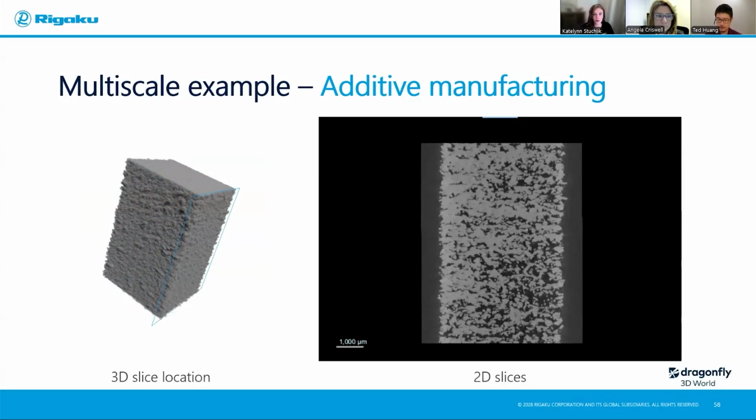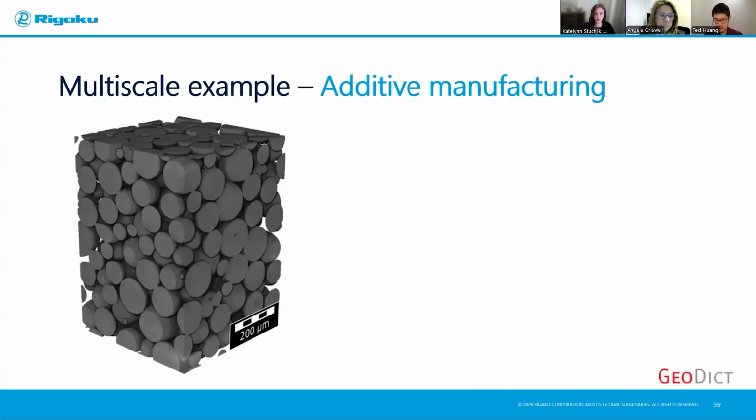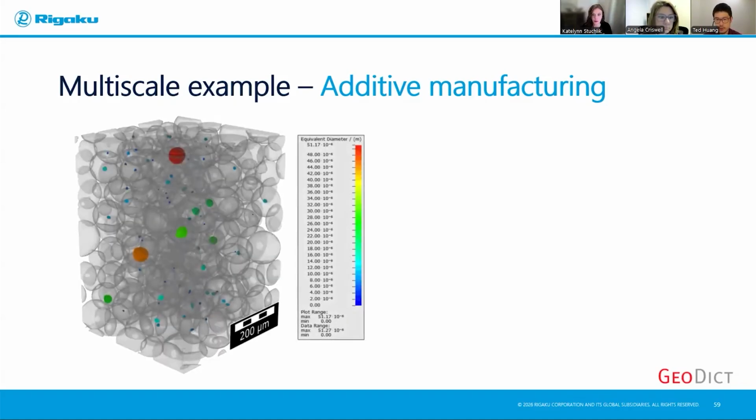For additive manufacturing, a lot of times it's the powder quality that's contributing to this kind of defects. So you might want to study, okay, let's look at the powder with a high resolution to see what happens. What's the quality of my powder? In this case, I show a scan here. This is a scan of the same powder, exactly the powder we used to make the sample that you saw earlier. And in this case, to show some analysis like porosity analysis.